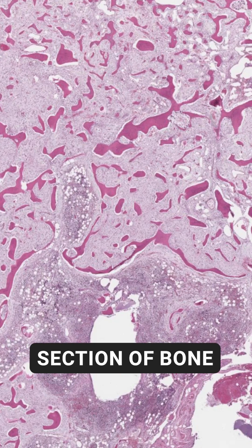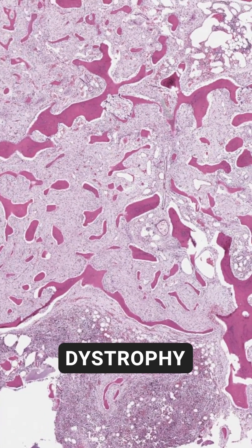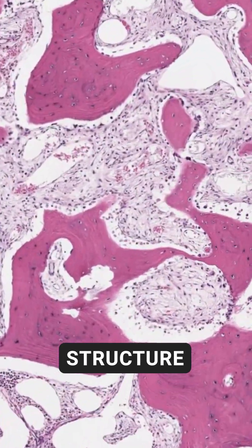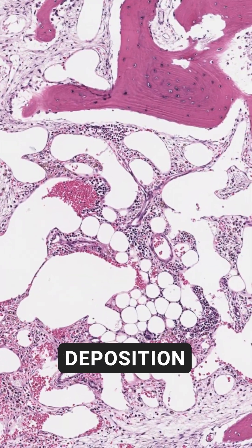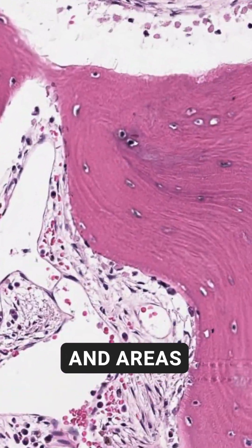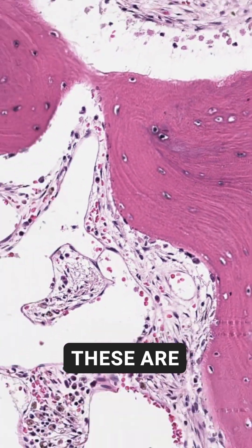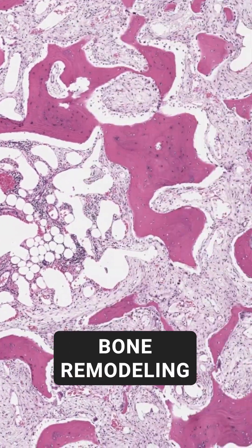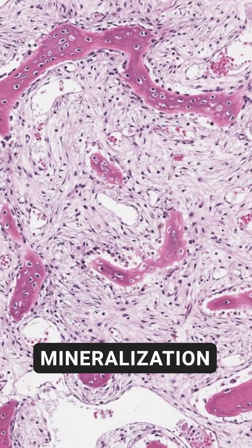This is a histologic section of bone affected by renal osteodystrophy. Notice the disorganized trabecular structure, increased osteoid deposition, and areas of marrow fibrosis. These are hallmarks of abnormal bone remodeling and impaired mineralization.